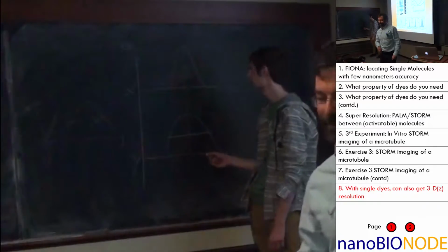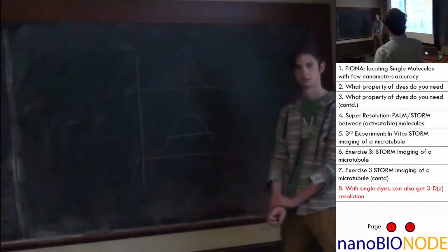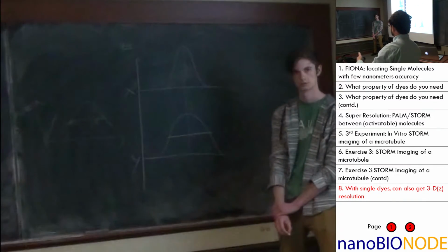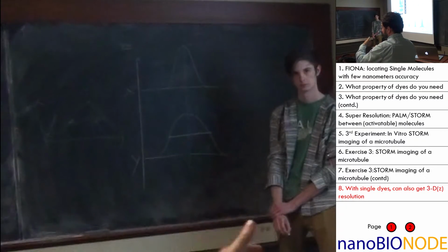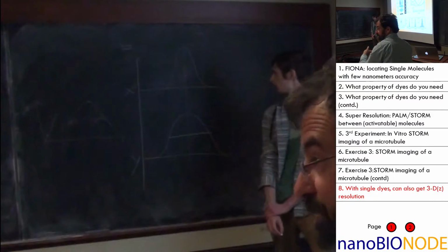Okay. And so the x direction, let's say the x direction hasn't changed at all, because it's going through a cylindrical lens, and a cylindrical lens means in one direction it doesn't change and in the other direction it does.